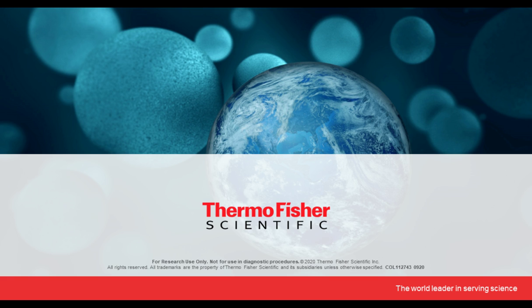Is No-Stain compatible with the LI-COR Odyssey? So, yeah, I'm not very familiar with the capabilities of the LI-COR Odyssey imager, but No-Stain basically has an excitation and emission. It can be excited at 488 and the emission is at 590. So as long as your imager is capable of doing that, then yes, there would be compatibility.